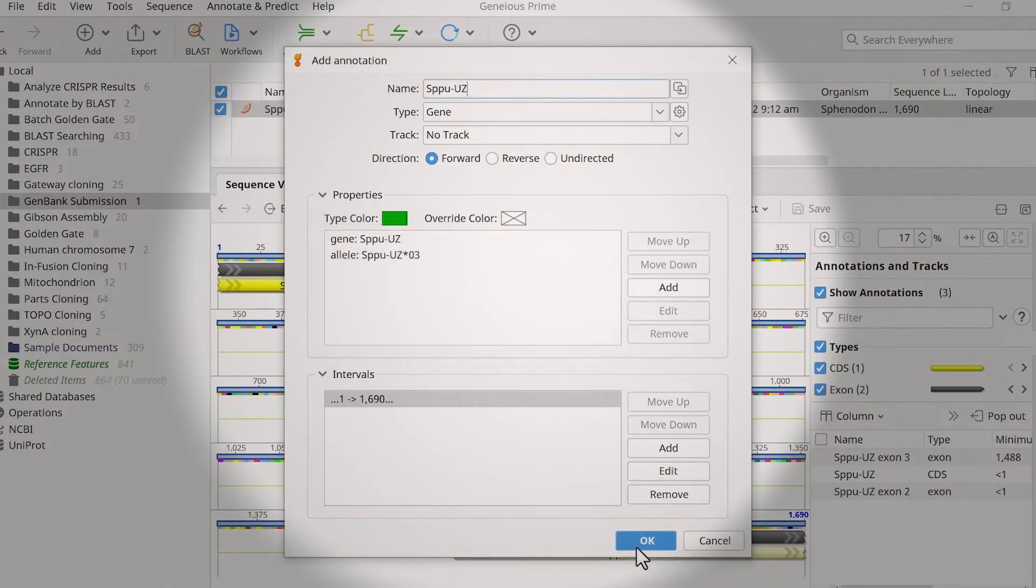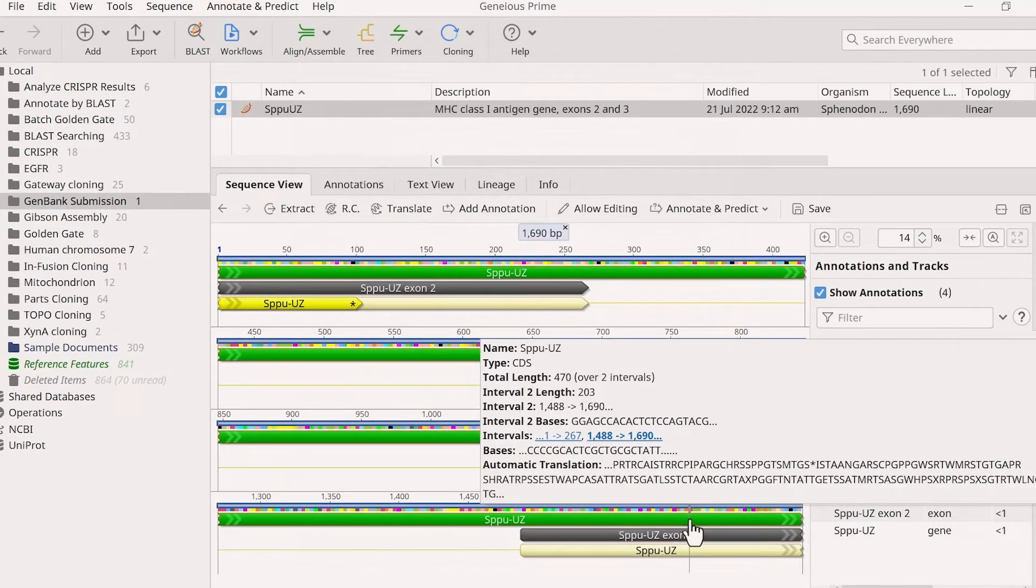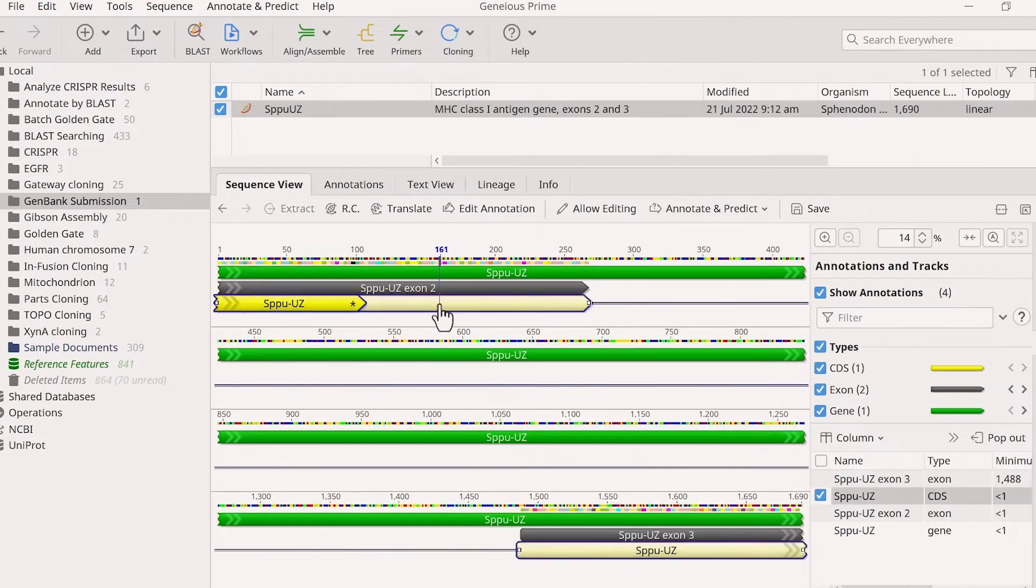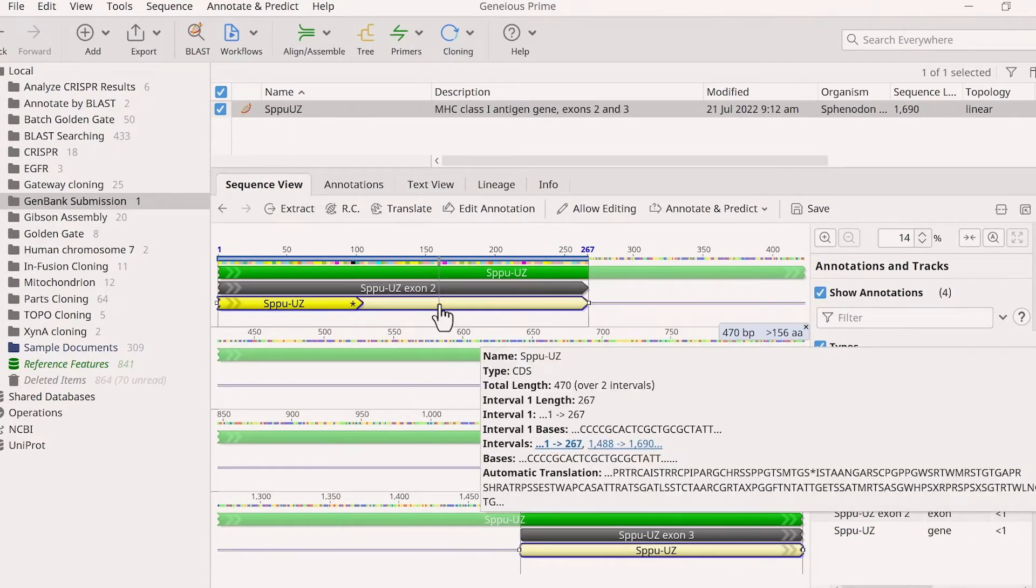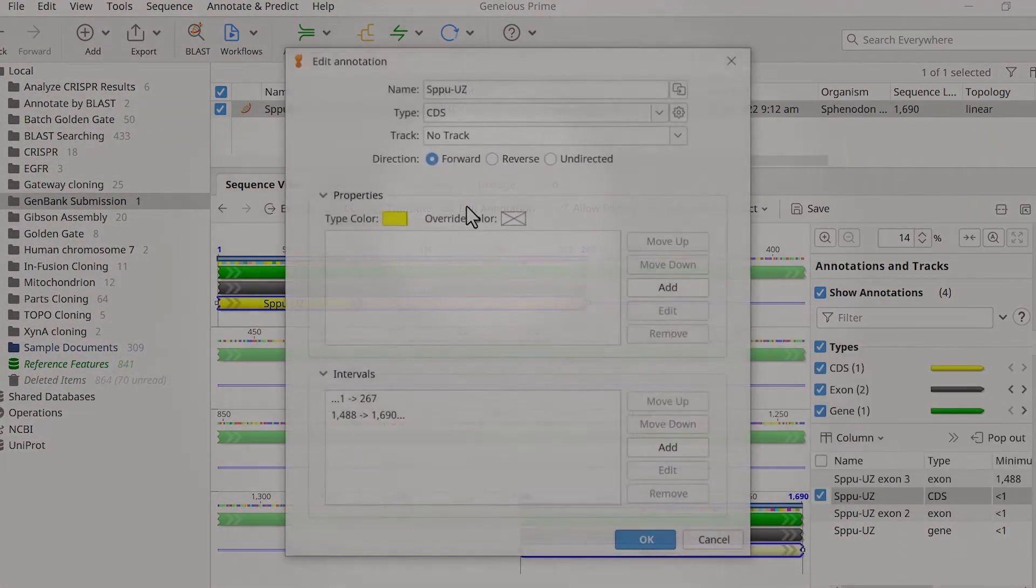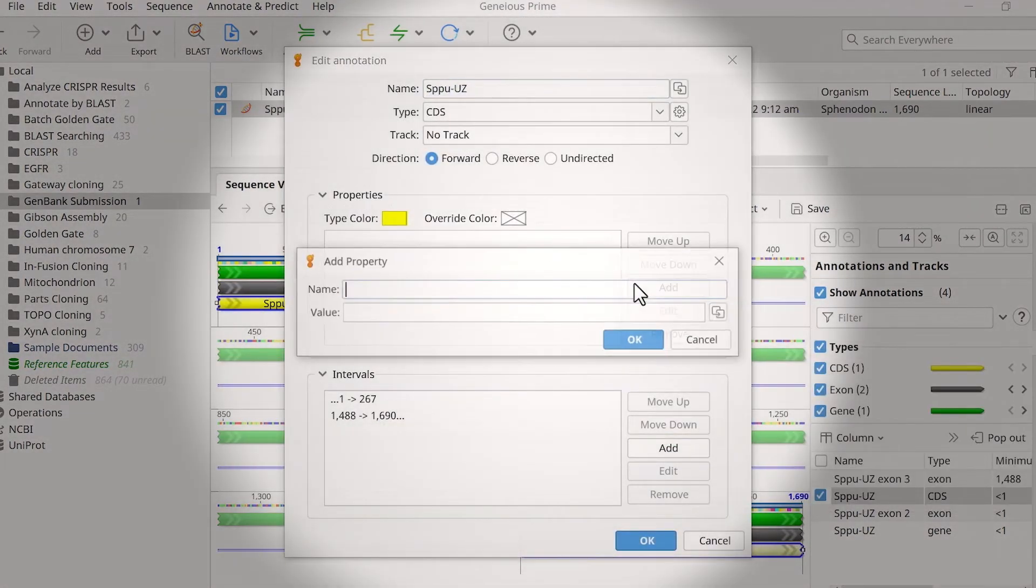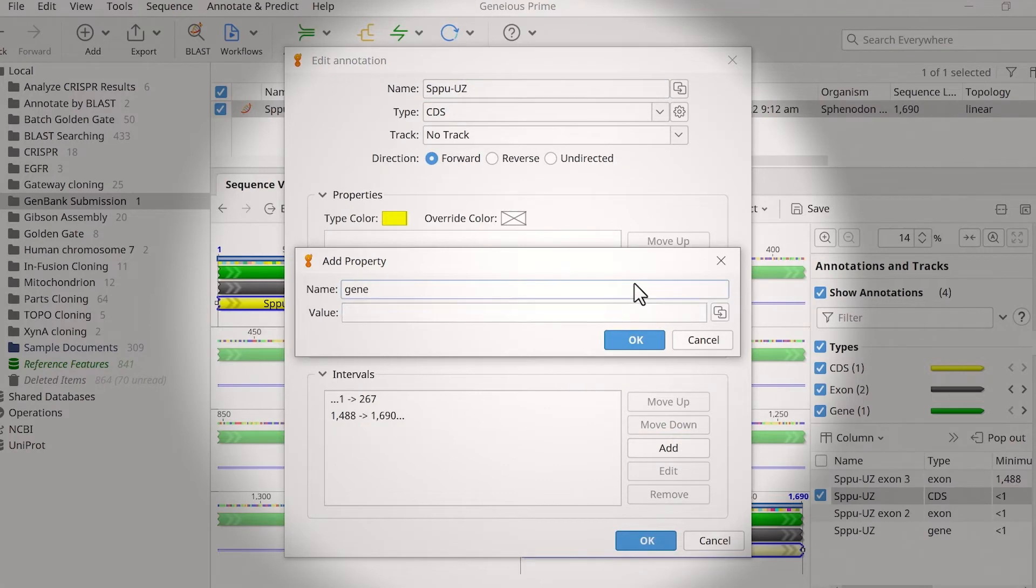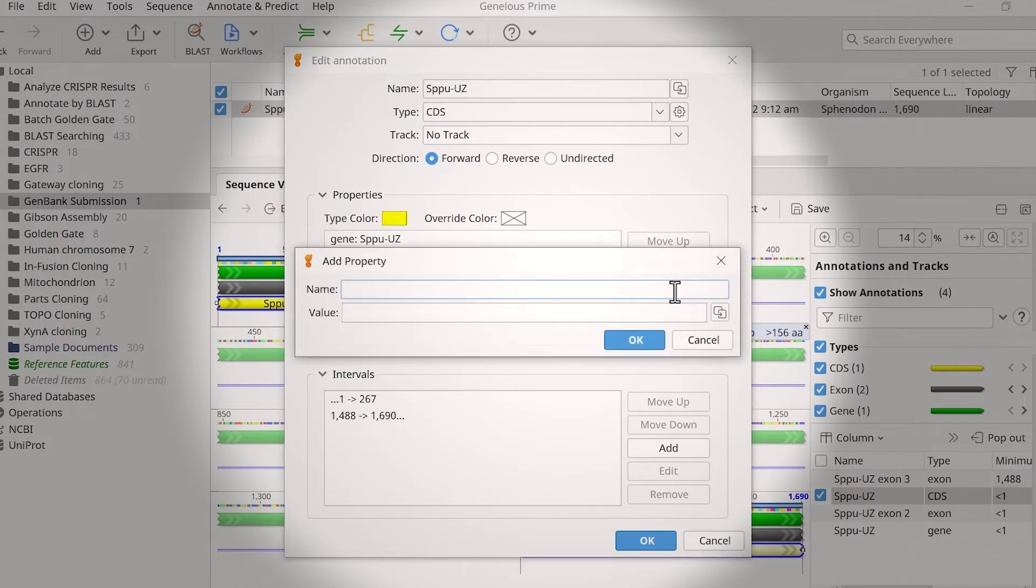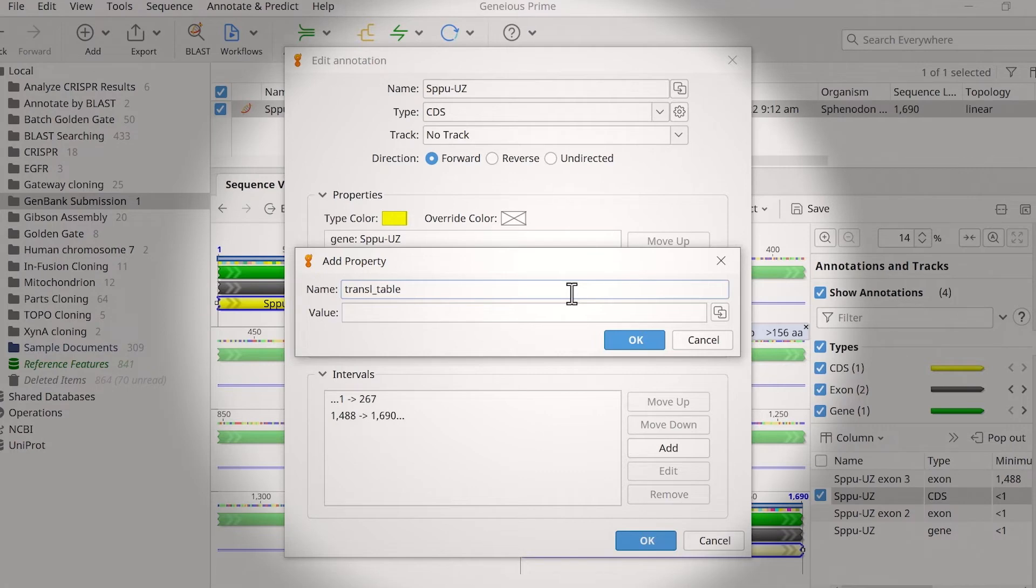With the gene qualifiers set up, you need to add the appropriate qualifiers to the coding sequence and exon annotations. As with the gene annotation, it's best practice to add a gene qualifier to your other annotations. Again, select Add in the properties window, enter the gene qualifier information, and click OK. Coding sequence annotations also require a translation table qualifier representing the genetic code used in translation. Refer to the NCBI genetic code tables page for a list of values. This example uses the standard translation table, so I will use value 1.